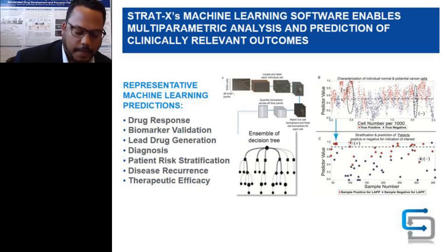For example, if one is going to predict metastasis in breast cancer versus metastasis in prostate cancer, given the same set of biomarkers, again, a very vast set of biomarkers, the hypothesis, of course, and what we've shown and demonstrated, is that those biomarkers are very different. But we did not pick those biomarkers. Rather, the machine learning algorithm decided upon those biomarkers.